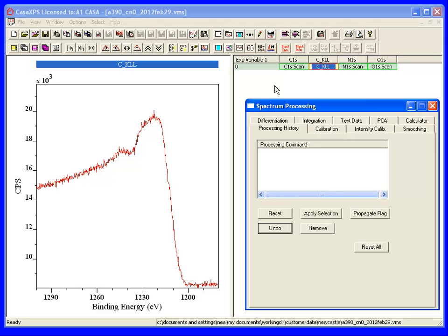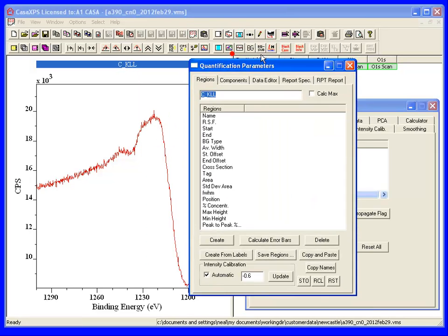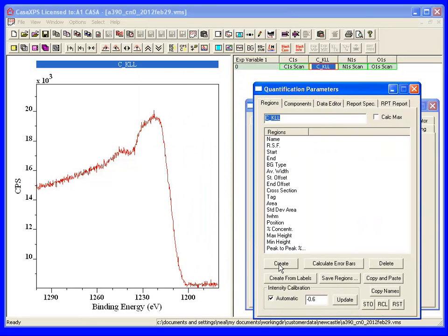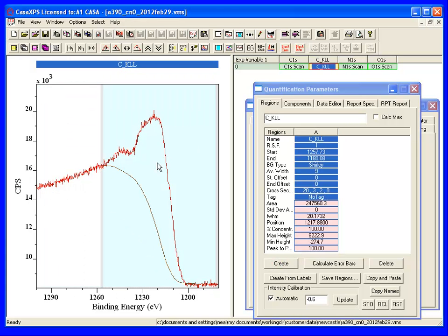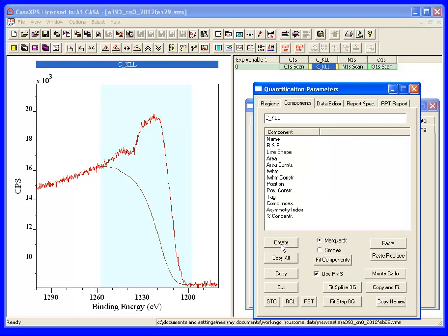So rather than just differentiating the data directly, we're going to introduce a synthetic envelope which will represent the data. Now in this case we really don't care whether the peaks are physical or not, we simply want to approximate the data.